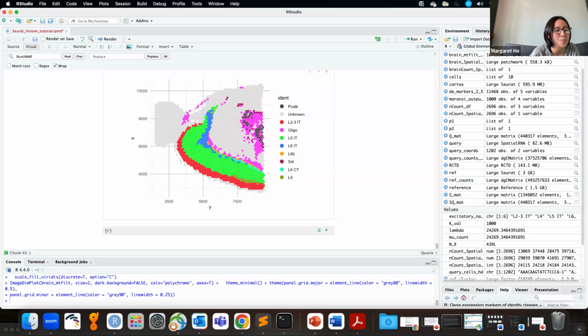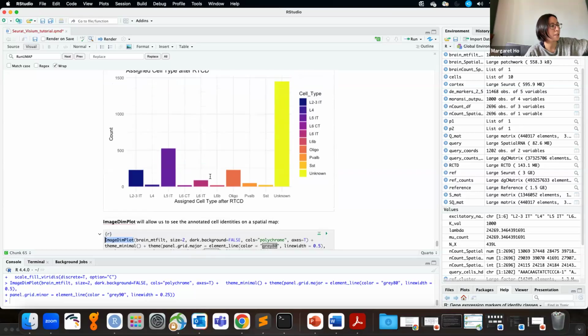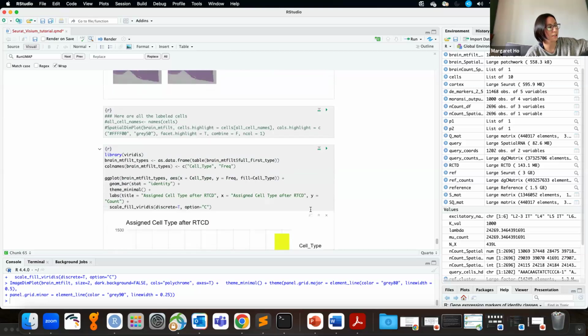Yeah, you're right. This is true. The image is upside down here. You can rotate the images with ggplot. There is actually a slight error in Seurat, which I have to report, where this got a little bit mirrored between ImageDimPlot and SpatialDimPlot. That's a good note. This is a package error that other people have reported but hasn't been addressed by Seurat. It gets rotated.